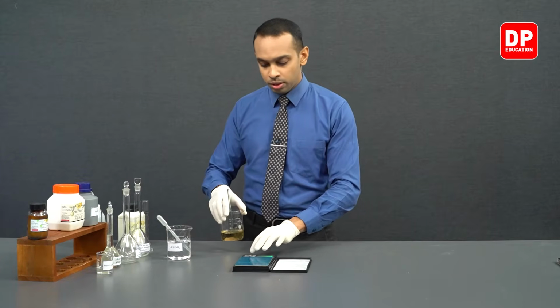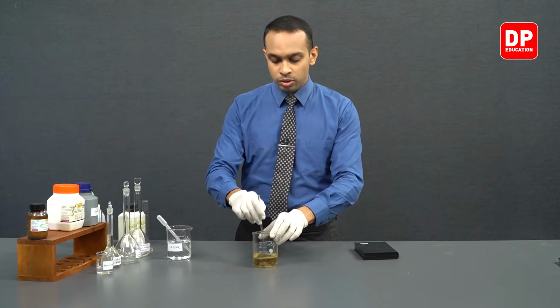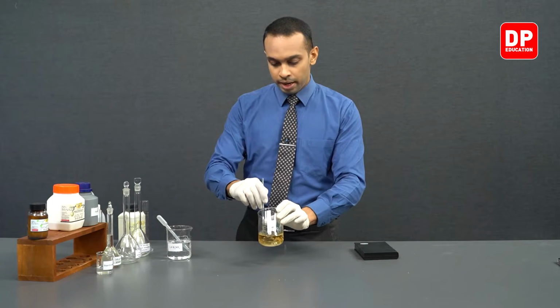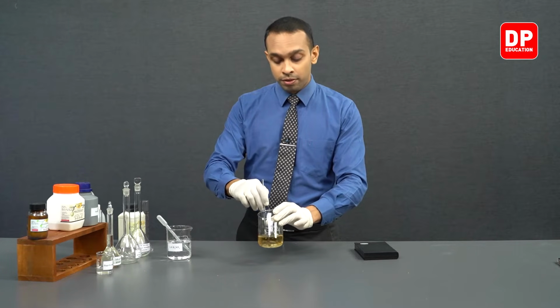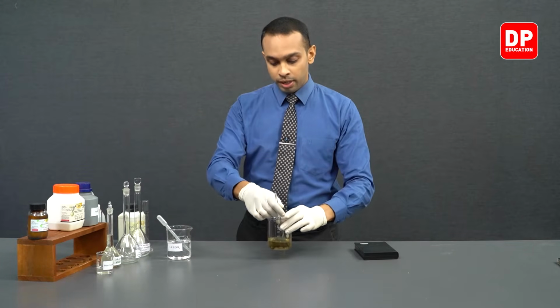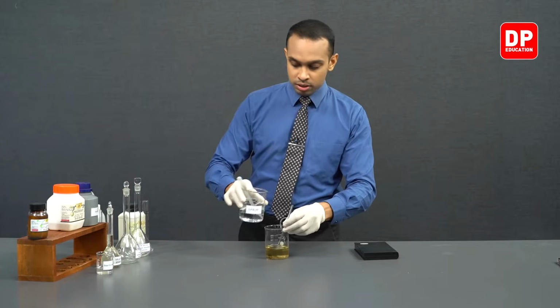Now, as you can see, students, the color of the solution is starting to change. That is because Fe3+ ions are coming into the medium. And you can see the majority of the ammonium ferric sulfate solid is dissolved in the medium. We will add a little bit more sulfuric acid since we are preparing a 250 milliliter solution.